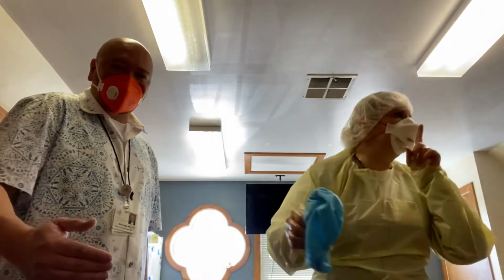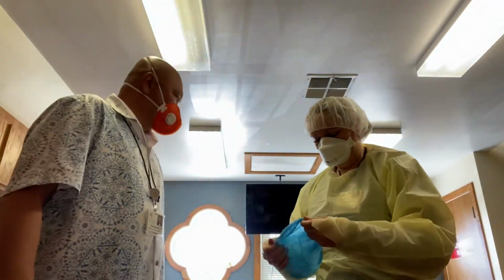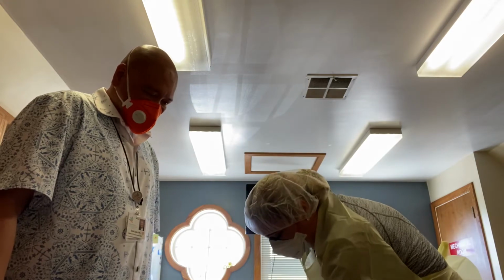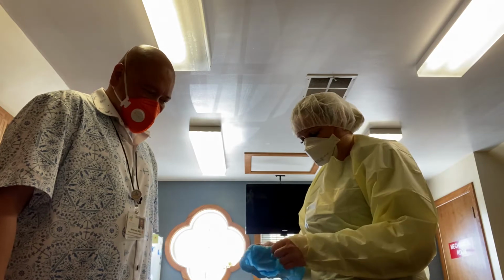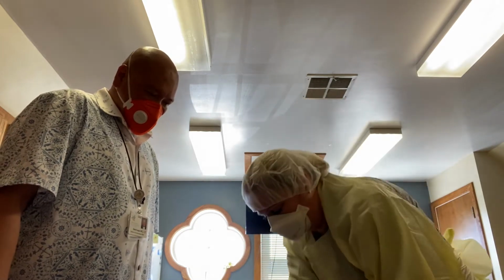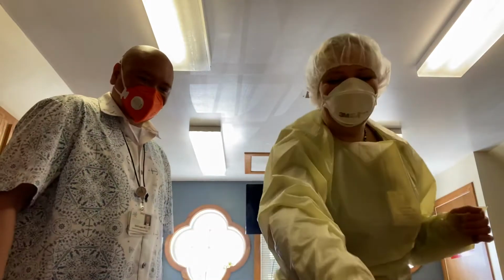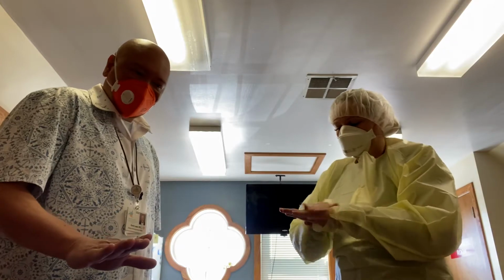As you notice, every step she does, she always sanitizes. Okay, she's got the shoe covers, then sanitize again. Yes, because I just touched my shoes. Make sure it's all dry.